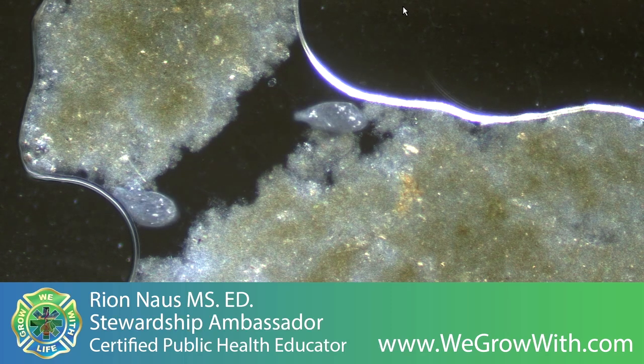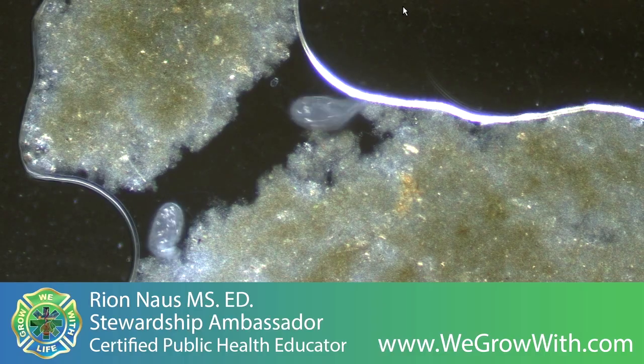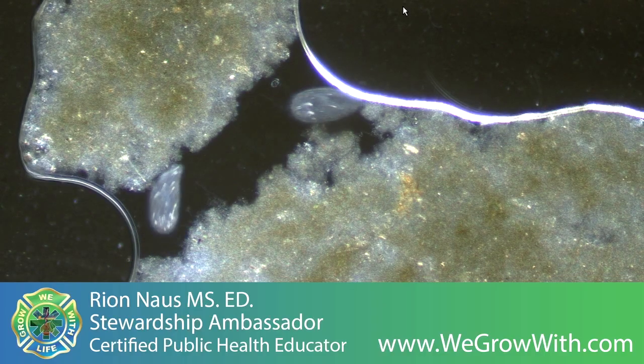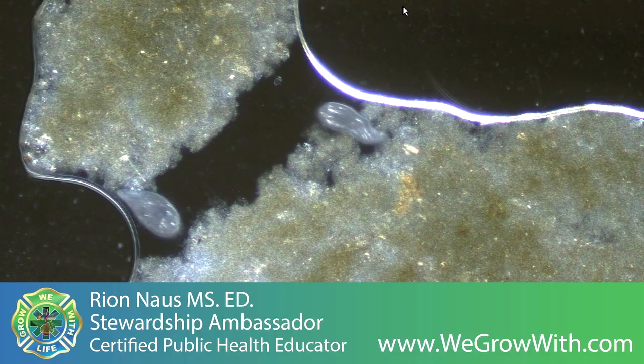And if you look at it, if you have a little raceway, that right there, when gentlemen like Martindale talk about capillary action, that pore space right there would be capillary action.